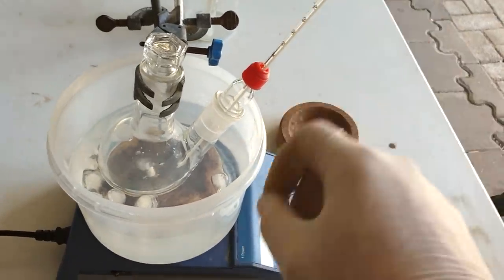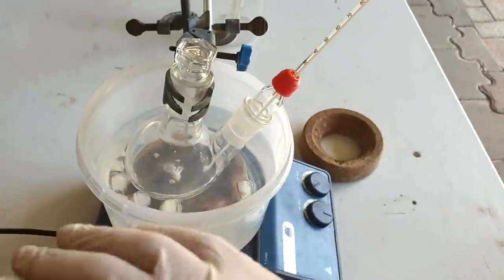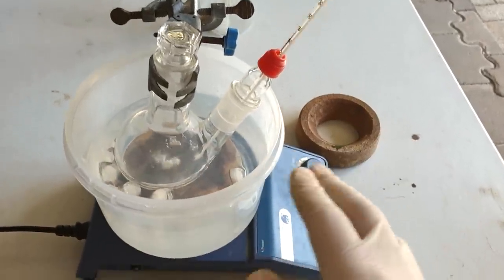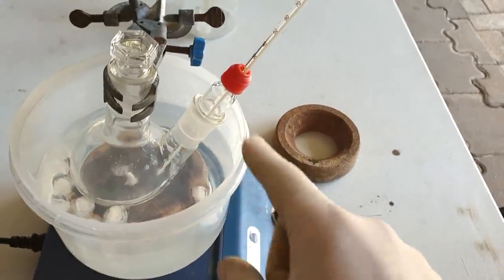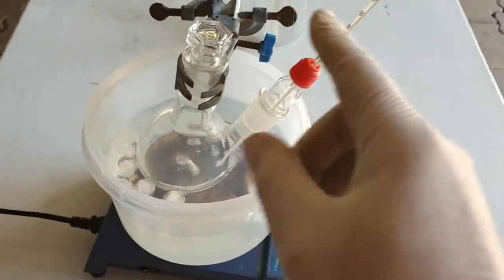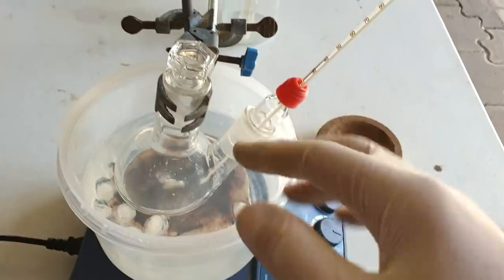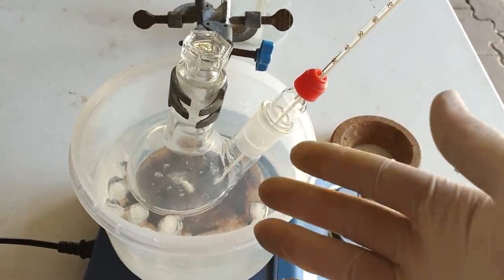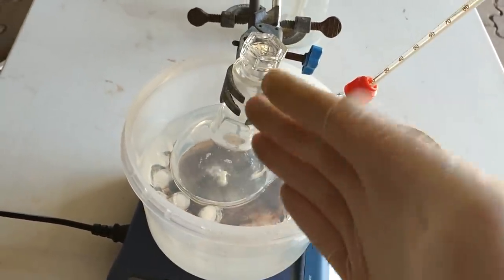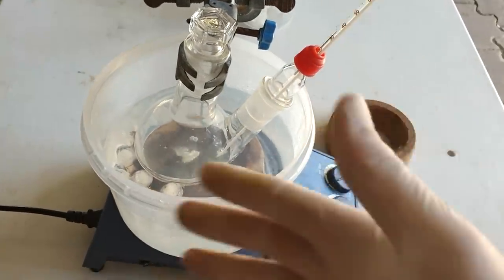It says if we go over 30 degrees at all, even for 10 minutes, it'll get destroyed. It won't work at all. We can run this reaction for just a couple of hours to completion at 27 degrees, but if we go 3 degrees higher, it just tars up apparently. So what is recommended, or what people seem to do with this reaction, is to go slightly colder, like 20 degrees or so, and then run it overnight, and then it still runs to completion.